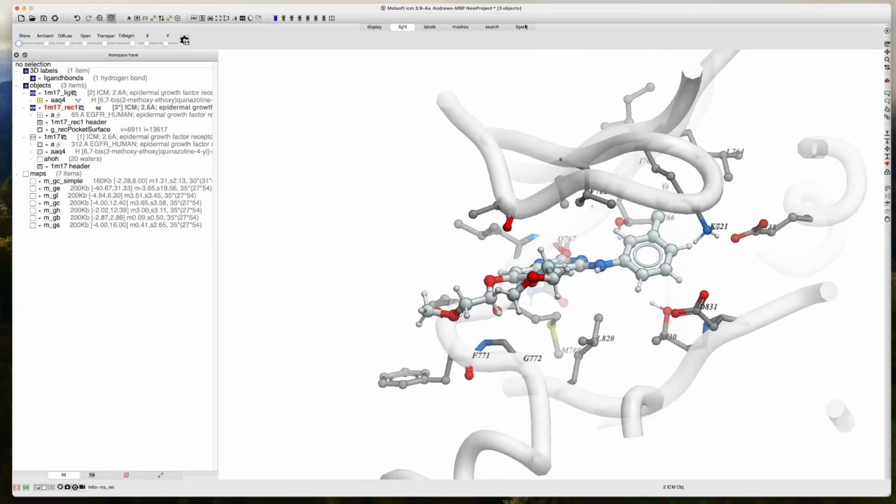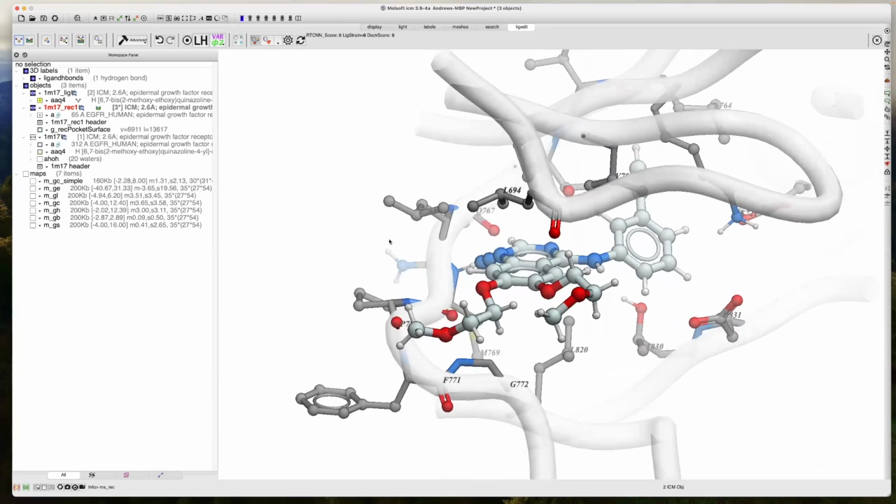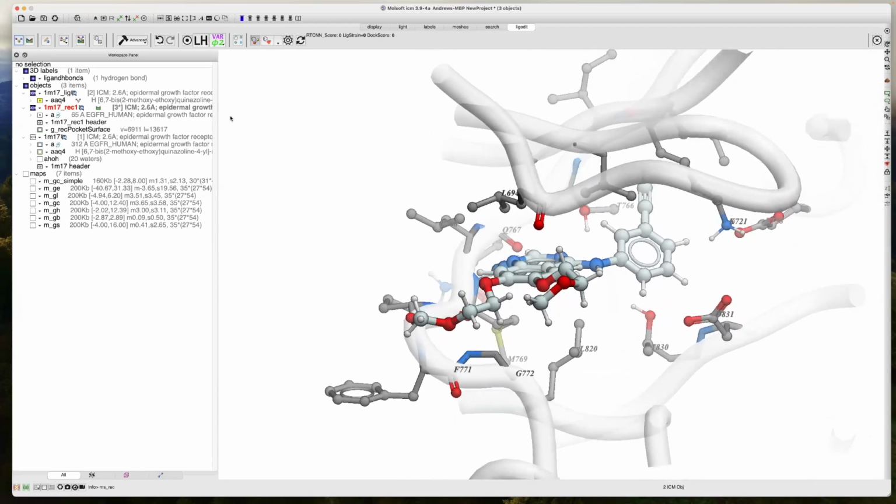Good practice after you set up the ligand editor is to do a small minimization of the ligand, because we've added hydrogens to the protein structure. So we just want to make sure we optimize the best pose for the ligand, and maybe iron out some little strain issues. So we can just minimize the ligand.